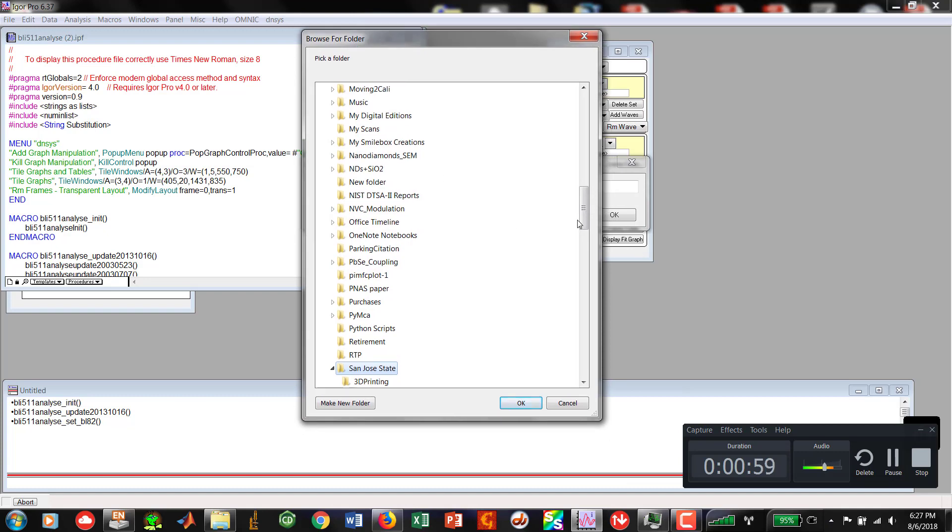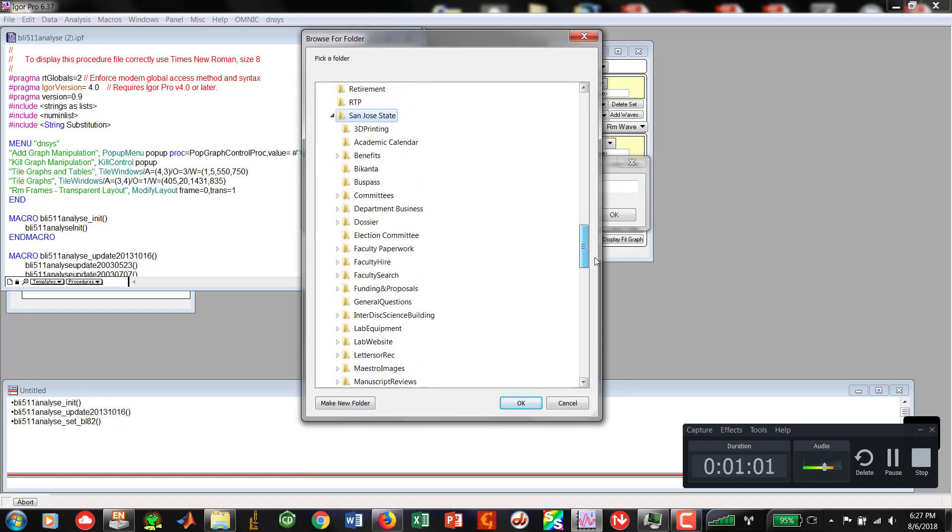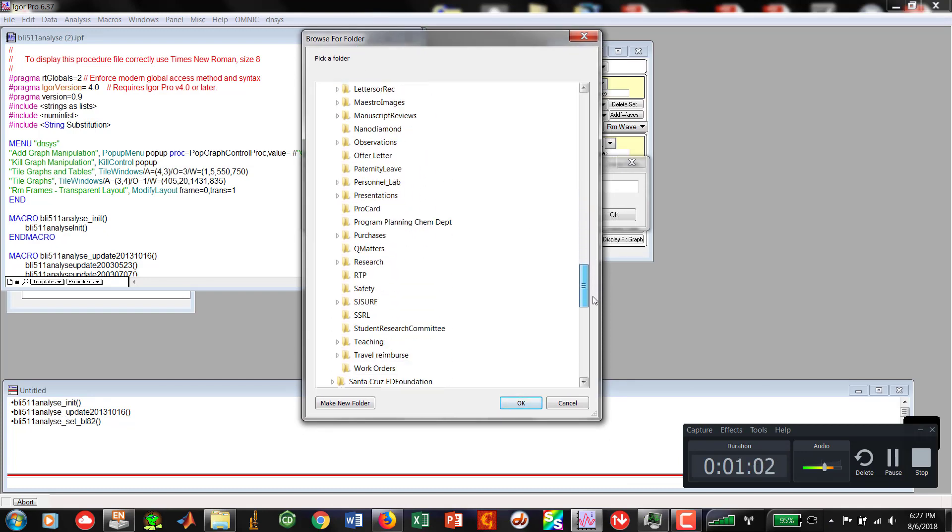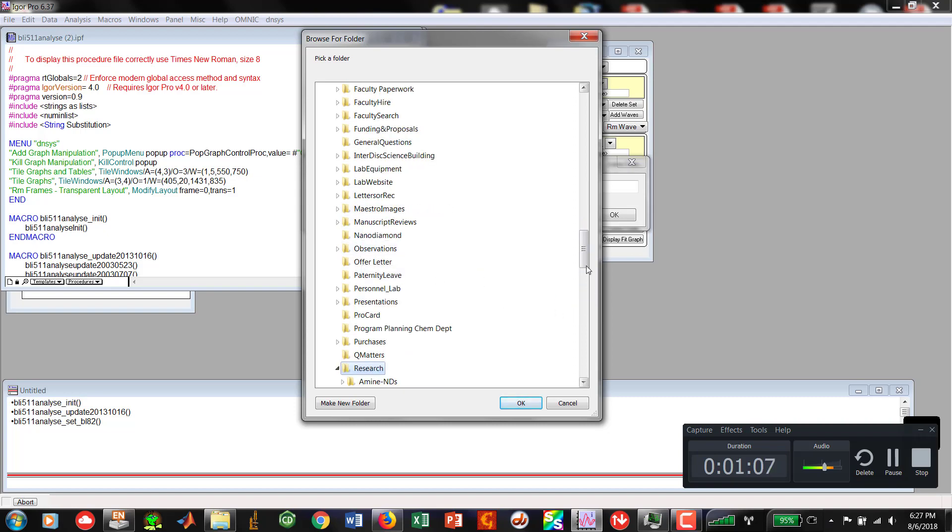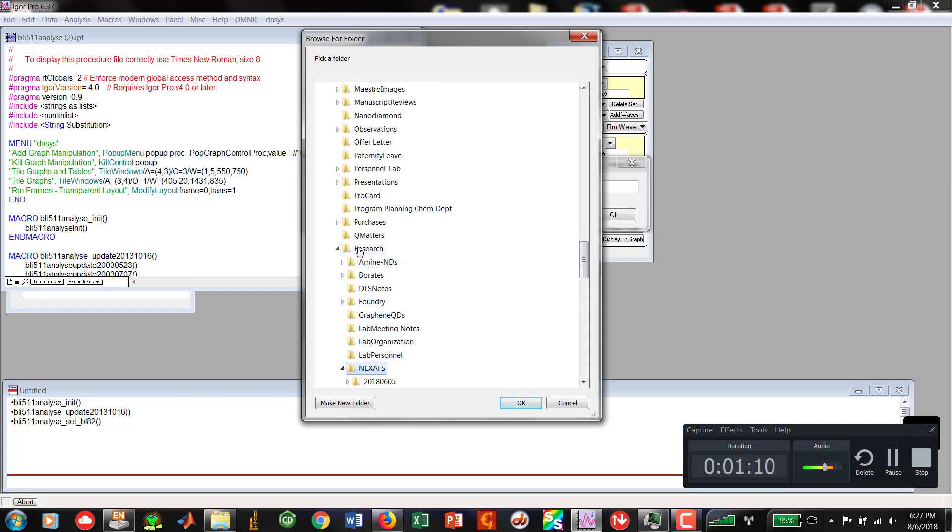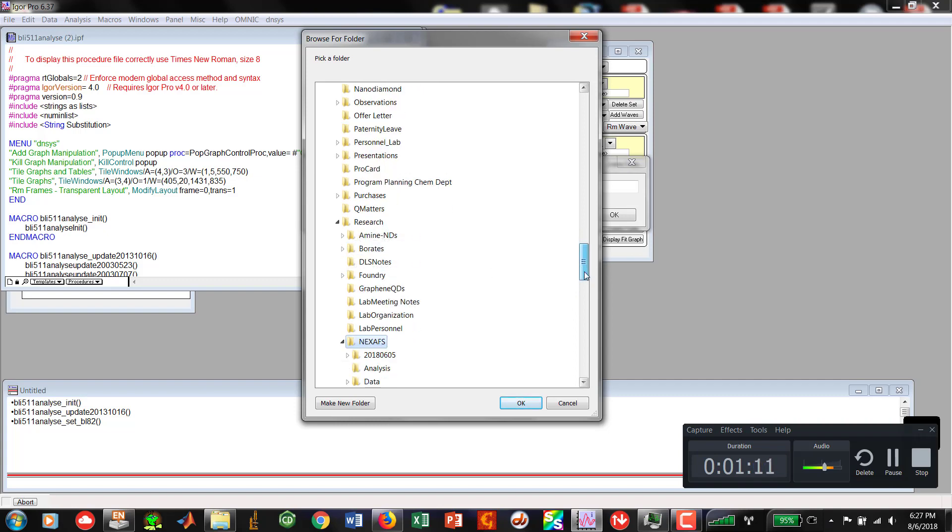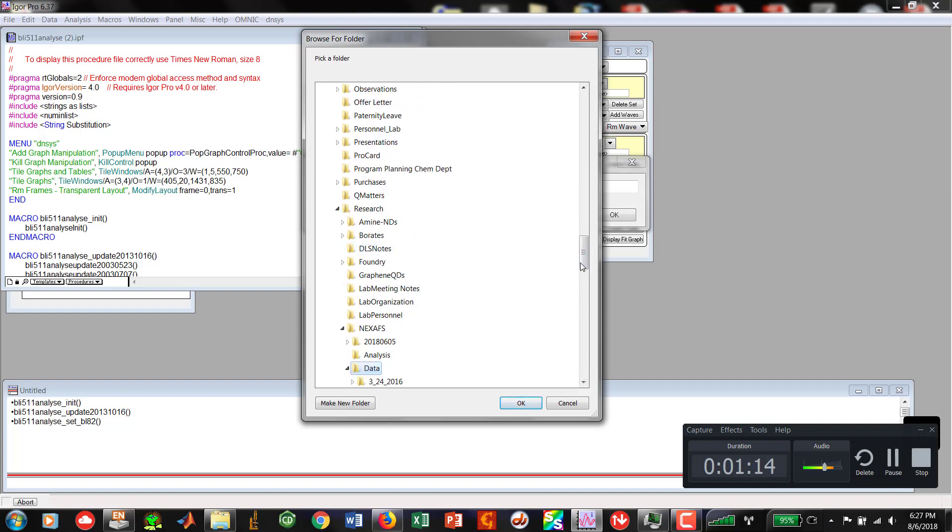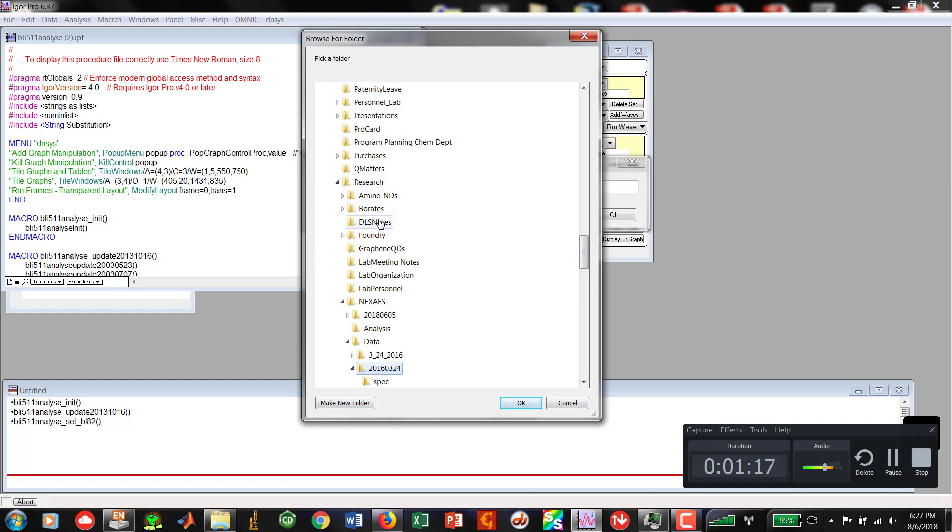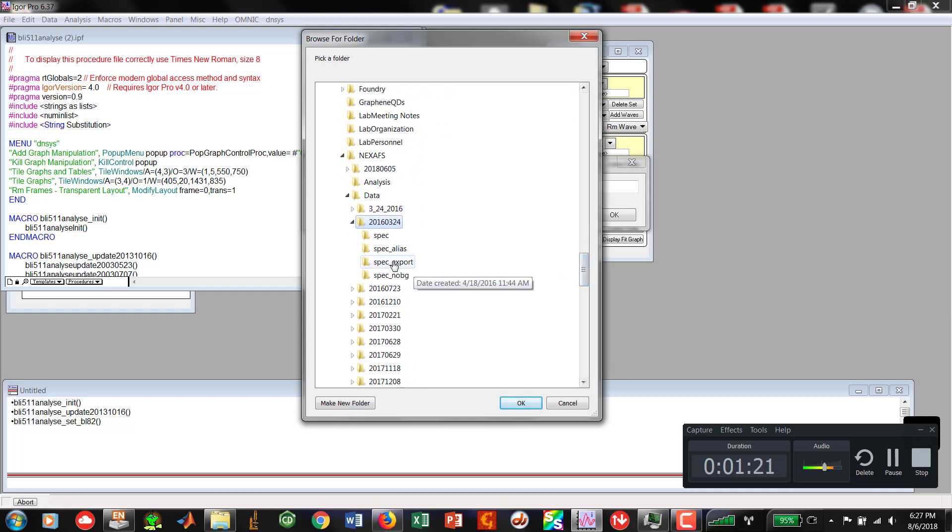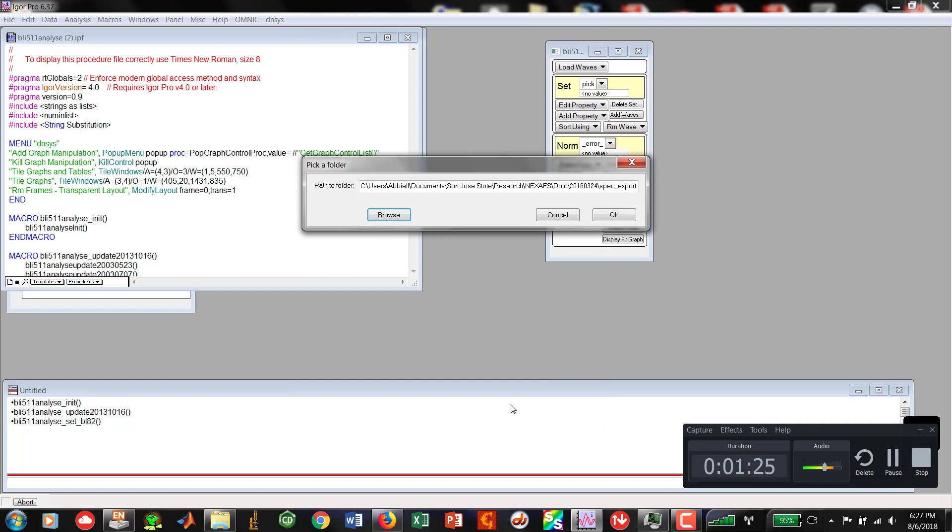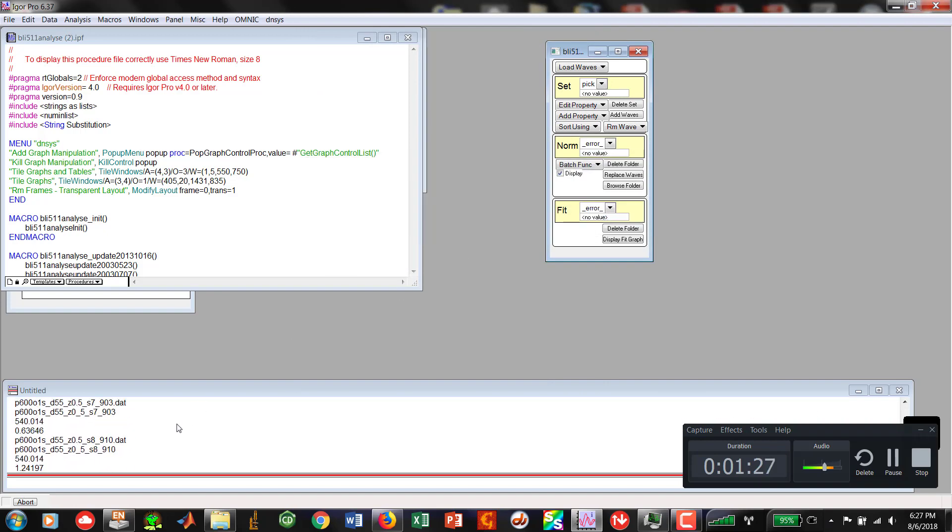Find our data very quickly, make sure to stay nice and organized. It will make your life a lot easier. Put all of your NexSaf data into a specific folder and work from there. So we've got research, NexSafs or XAS, and then down to raw data, and then to our folder. I'm picking 2016-03-24, spec underscore export, hit OK, and then let it load.